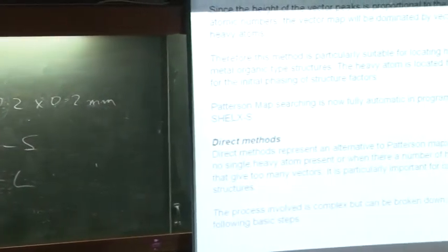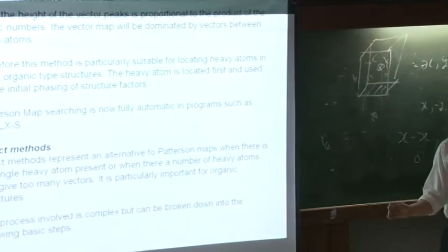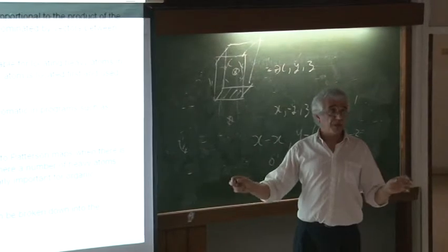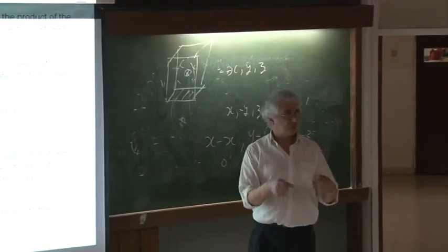So those two pieces of software are now the crystallographic standard across the world. So if you ever need to do any, and even for powder diffraction you can use it, if you're using pseudo-single crystal data.